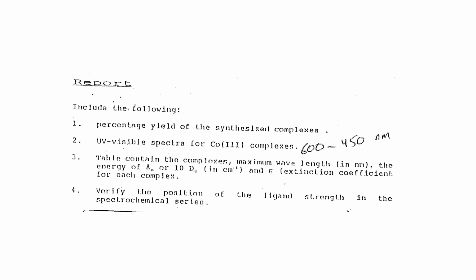Explain why, as I explained in this lecture, how the delta changes from Cl minus to NH3, and the reason for changing delta in each of these complexes. And this will conclude the experiment about the spectrochemical series.